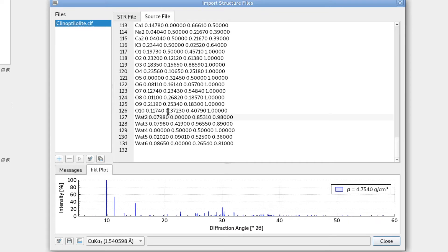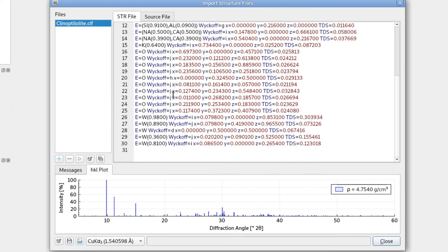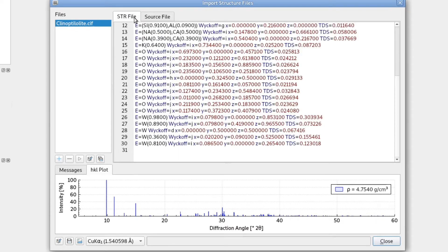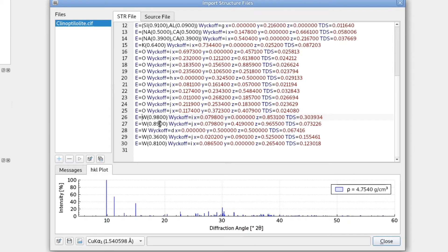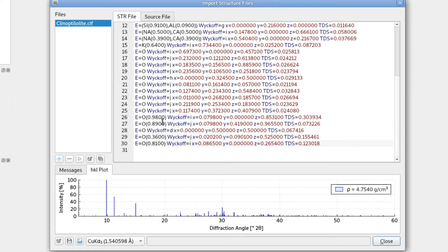But what Profex does now is it doesn't know this symbol. So it tries to determine the element from this text here. And it only finds the W letter and it does not know how to interpret the rest of the string. So it assumes that it is tungsten, which has the element letter W, which of course is wrong. So in this case, the auto-detection of the element went wrong. And what we have to do is change it back to oxygen, like so.